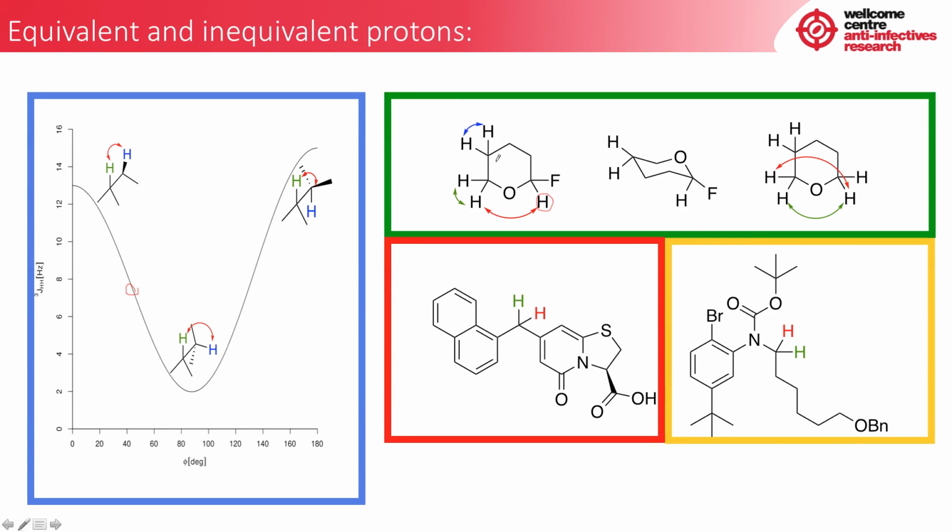And in fact, it's easier to see in this type of conformation. And even if the molecule was symmetrical, you would find that the protons on the faces are in fact different to one another, and indeed these are different to one another as well.